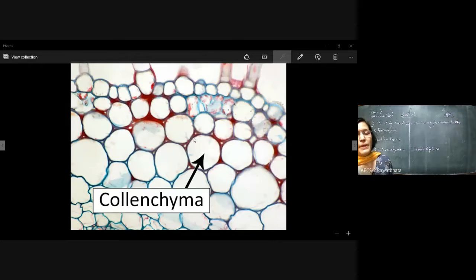We are going to compare sclerenchyma and collenchyma also in one of the slides. But here, if you observe carefully, it is only the thickening where the adjacent cells are attaching. There, they have this thickening to fill that. So automatically, there is no intercellular space. Once again, the thickening is there between the cells, not on the walls of the cell, as it happens in case of sclerenchyma.